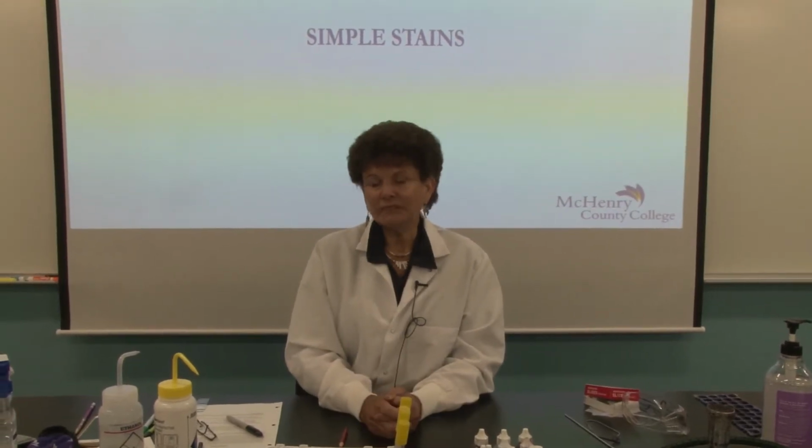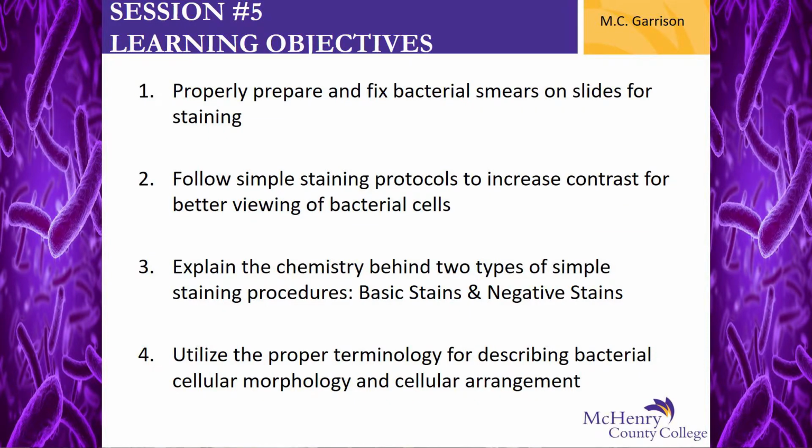Before we get started, let's take a look at your learning objectives for this session. First of all, I want you to be able to properly prepare bacterial smears on slides for staining purposes. In addition, I want you to follow simple staining protocols in order to increase the contrast between bacterial cells in the background so that we can view them more readily under our microscopes.